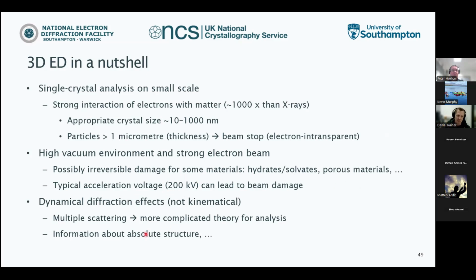And then lastly, diffraction now doesn't occur kinematically anymore, as it is the case with X-rays, but is dynamical. I mean, we have multiple scattering, we have multiple interactions within the sample. So basically every reflection is not the result anymore of a single interaction of incident beam and sample that can be collected, but it's the product of several of these.